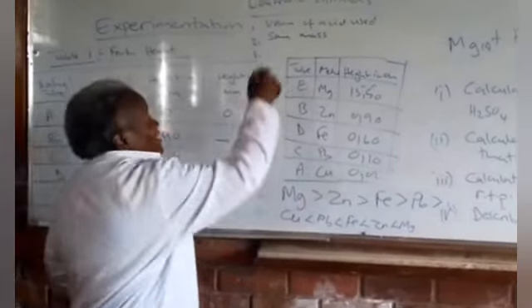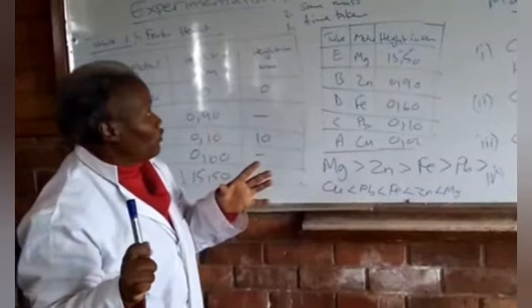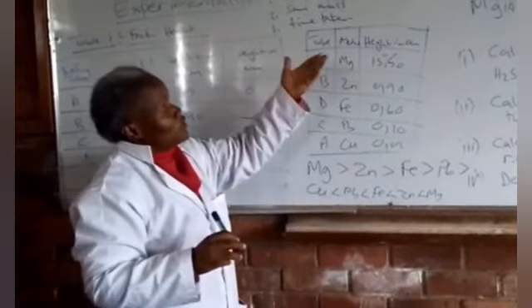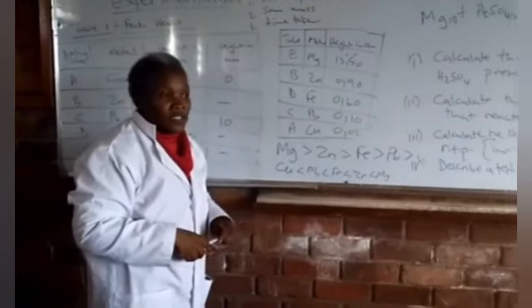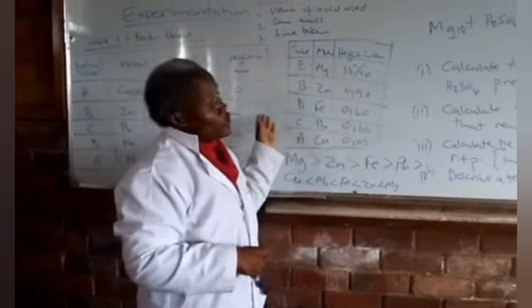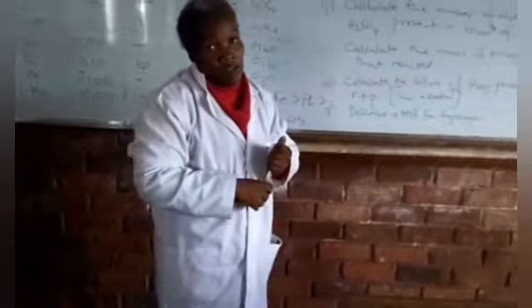Okay, and also the time taken for the reaction to occur. We tried to make each reaction go for 3 minutes before taking the froth height. So time taken also falls under controlled variables, because if the time taken was different, that would also contribute to some differences in the height. I now hope you understand what we meant by the independent, dependent and controlled variables. For those who are asked to design experiments, I'm sure you can see how to design your experiments. In the procedure, when you're taking volumes, you must also state the quantities as well as the measuring instruments that you are using.